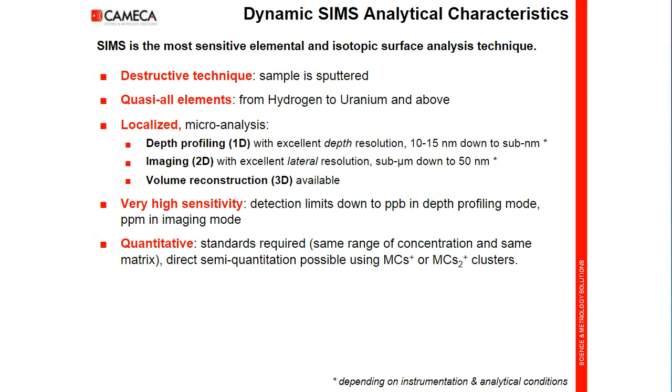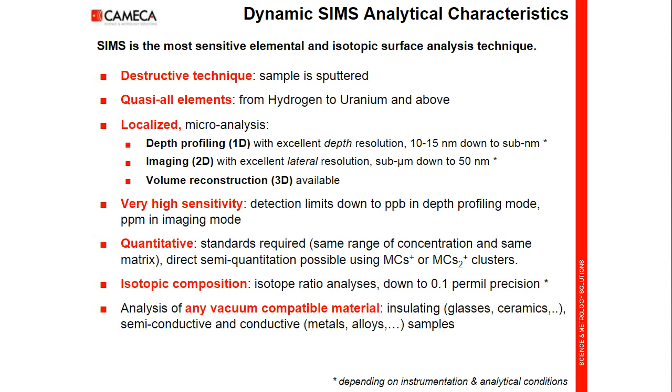Direct semi-quantitation is possible in some cases using MCS plus cluster technique. Dynamic SIMS has the additional capability to measure very precise in situ isotopic ratios. It can be applied to any solid material that can be maintained under high vacuum, conductive, semiconductive, and also insulating samples.